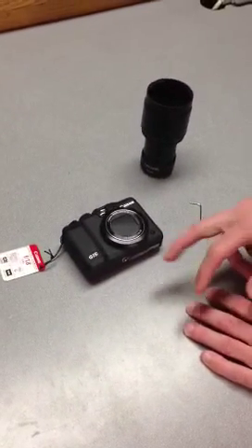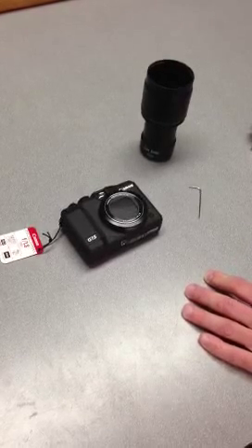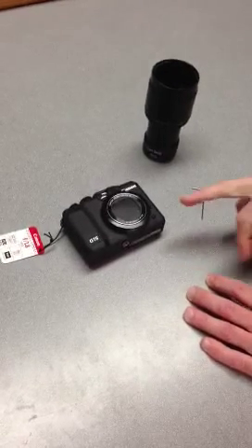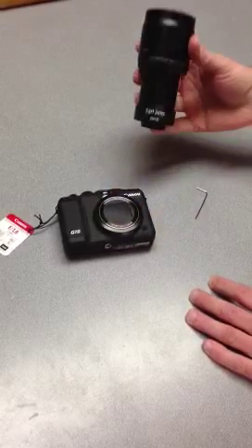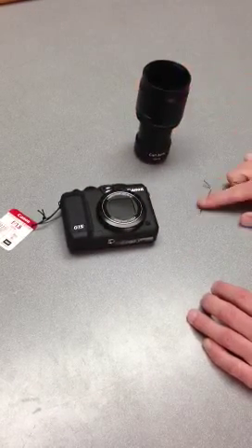We're going to go over how to install your Canon PowerShot G15 camera onto your microscope. You just need three parts for this: the camera, this microscope adapter which I've pre-assembled for you, and this little Allen key.